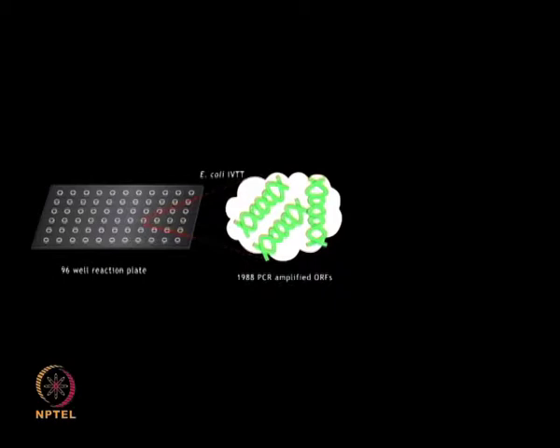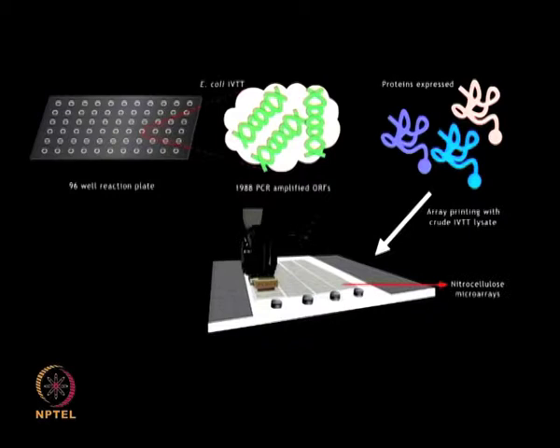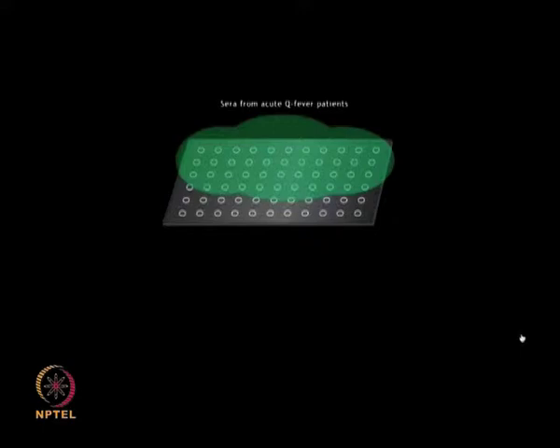Case study 4, identification of immunogens of Q fever caused by Coxiella burnetii, study by Baer et al, 2008. Baer et al carried out in vitro transcription and translation of 1988 open reading frames of C. burnetii by using E. coli based cell-free systems. 75% of the open reading frames were successfully generated as full-length proteins by using the cell-free expression system and then spotted onto the nitrocellulose arrays.